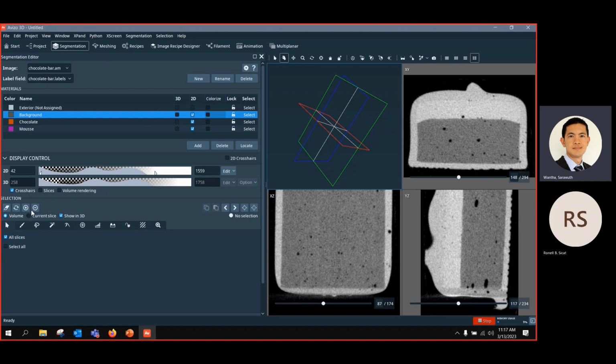So we have the tool that you can add or remove the selected materials. And we have this replace, for example, if you want to replace one material by another. And also we can erase this selection or clear selection, but not erase. Yeah, everything will be clear when we do some example.